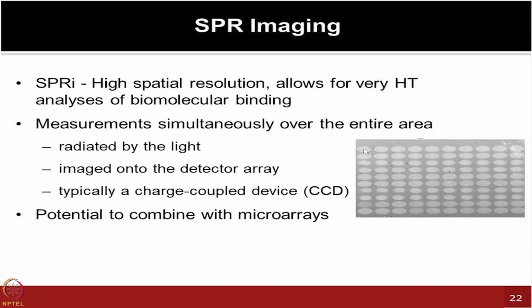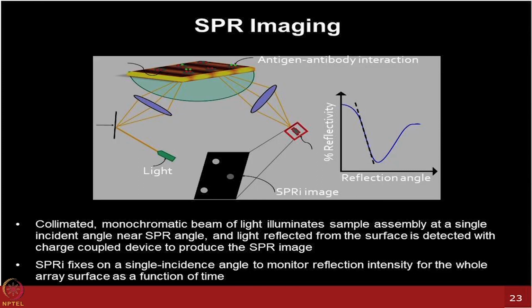So, this is one of the images I am showing, from one of the experiments I was doing in Josh lab earlier when we were developing some SPR imaging based platform on the early prototypes. As I mentioned to you, you are seeing just the pseudo image. You are not measuring fluorescence. These are some of the pseudo images obtained from this kind of platform which shows you compatibility with SPR imaging.